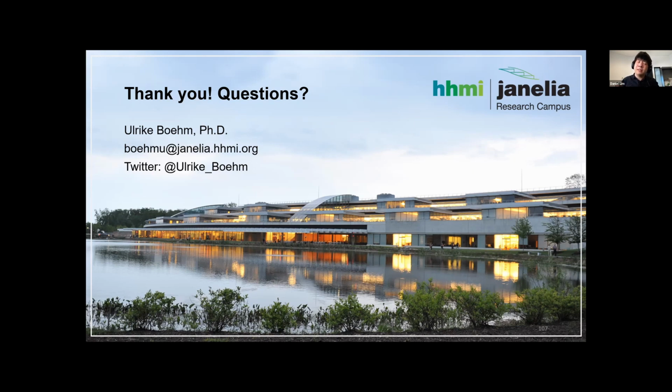Yeah, so I think that's also a point which John kind of brought up. The redder the wavelengths, the more extended the stuff. So based on the Abbe equation, in general, when you have smaller wavelengths, you also have a higher resolution because you are kind of smooshing this into a smaller volume. And that also comes back to what Steve mentioned at the beginning about the 3-dimensional resolution.